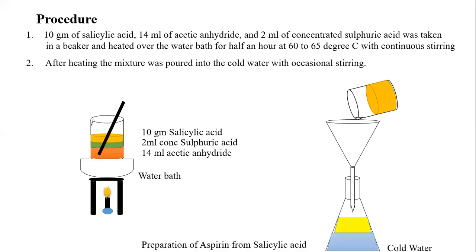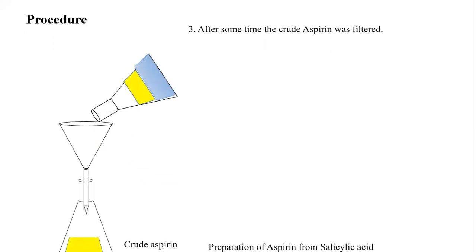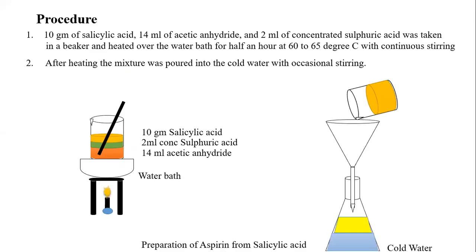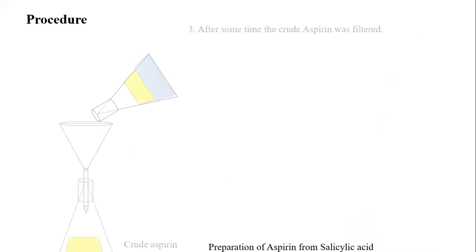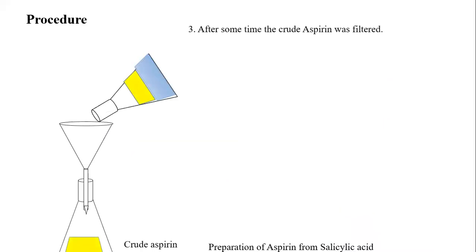After heating, the mixture is poured into cold water with occasional stirring. After some time, you can see that the mixture has formed a precipitate, shown here in yellow color. That yellow crude aspirin needs to be filtered, so here we have filtered it using a funnel into a conical flask.